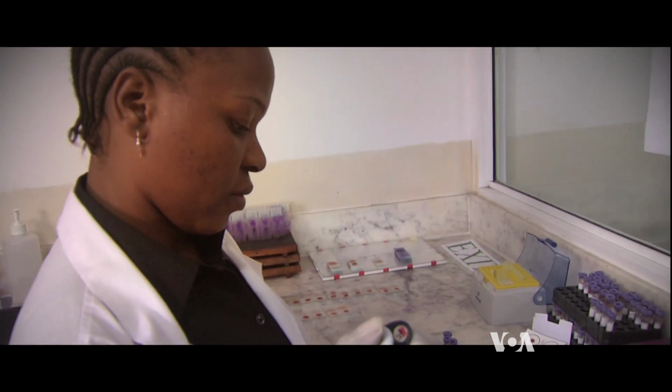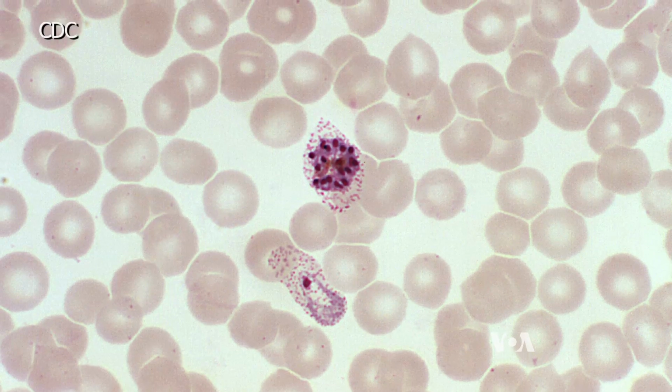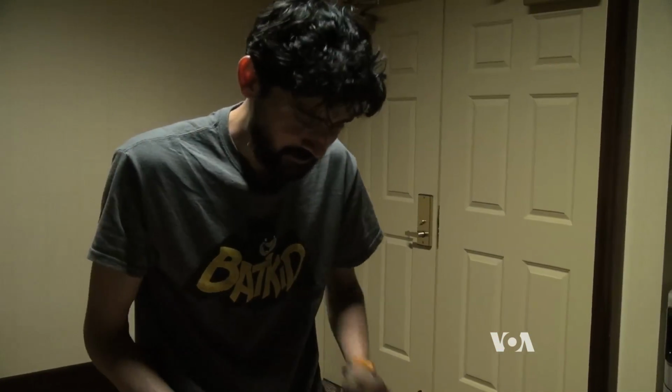And in places where lab equipment is hard to come by, Prakash says the Foldscope could help diagnose diseases like malaria, African sleeping sickness, and more, as clearly as these microscope images. There are roughly maybe 10 diseases that we can immediately start making an impact on, but it's a long road. It's a step in the right direction, says London School of Hygiene and Tropical Medicine biomedical engineer Aurélie Gendron, speaking via Skype. It seems to be quite a nice piece of engineering.